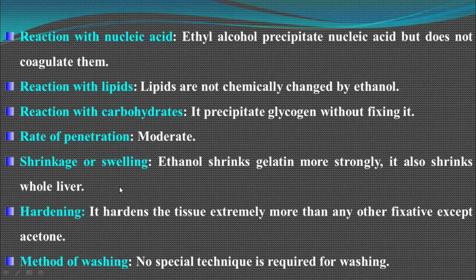By fixing the tissue in ethanol, the tissue hardens extremely, more than with any other fixative except acetone. There is no special technique required to remove this fixative from the tissue. That is, for washing, no special technique is required.